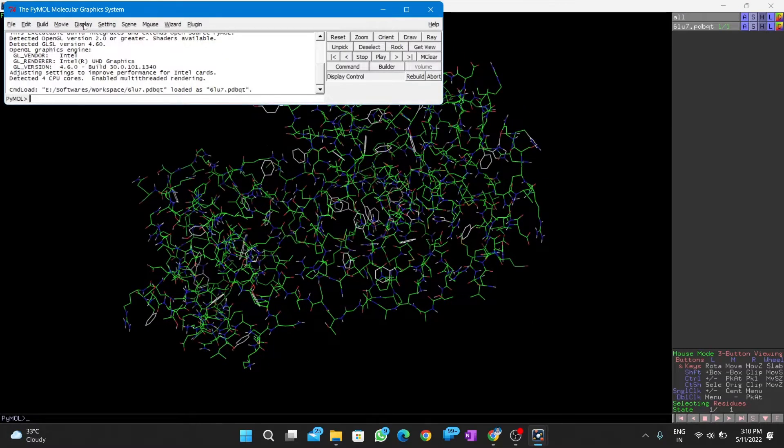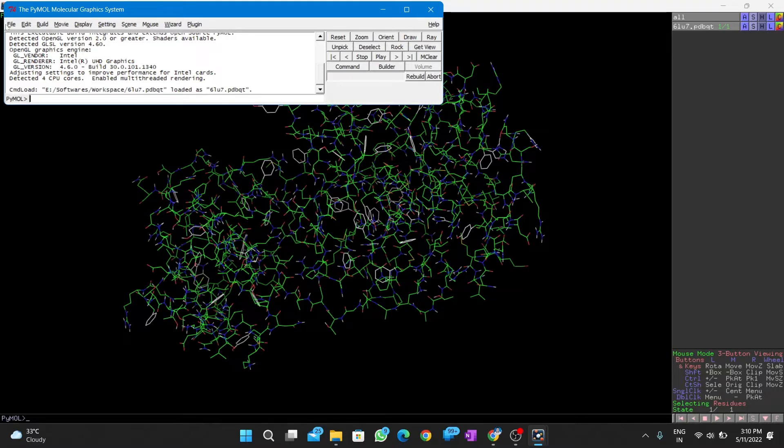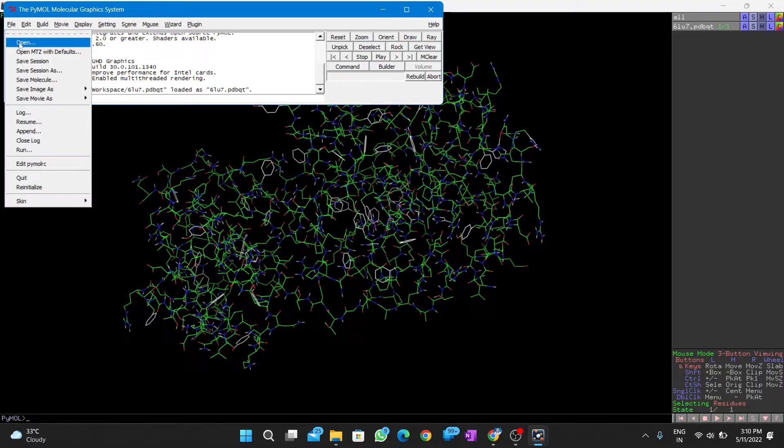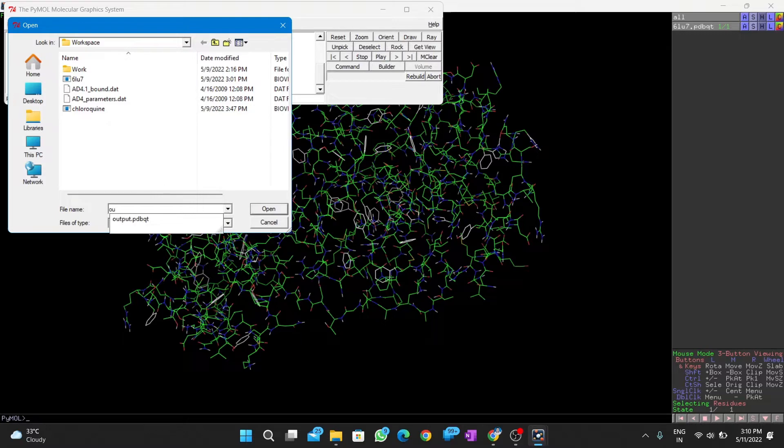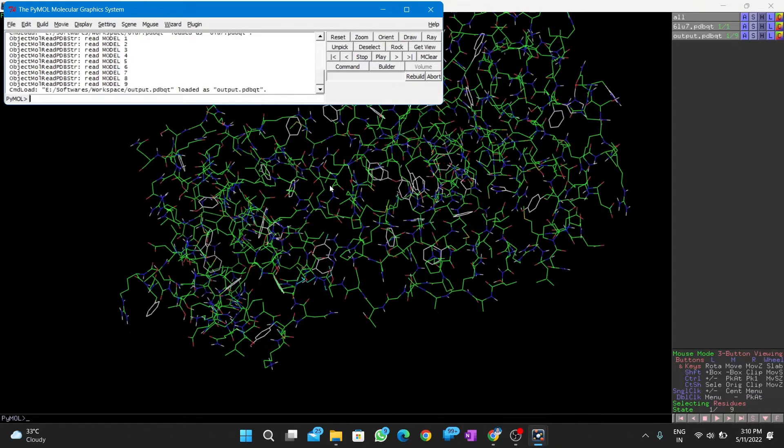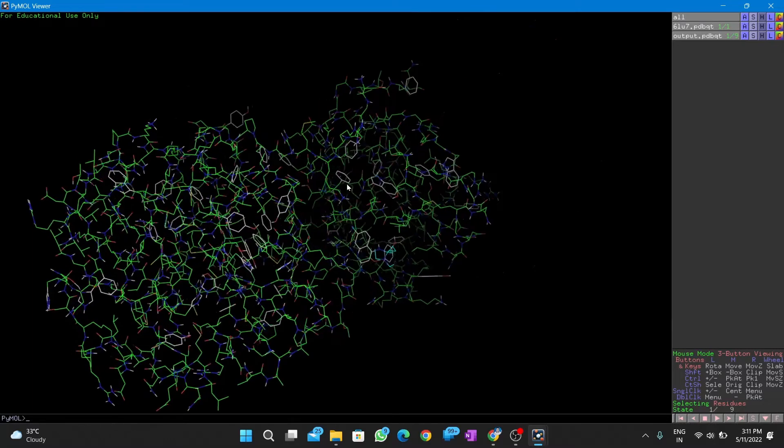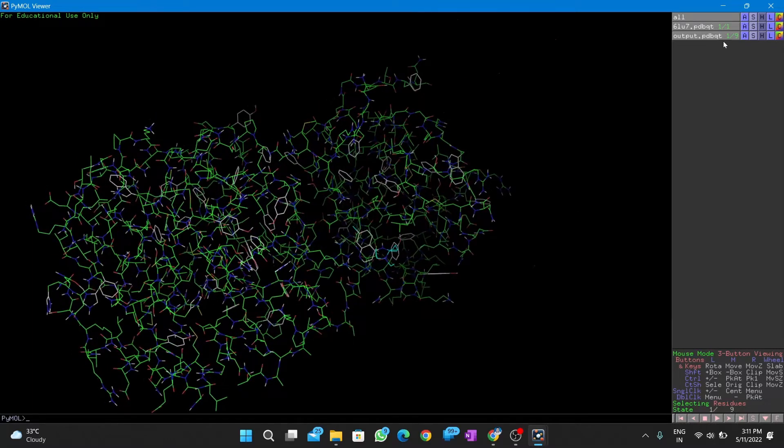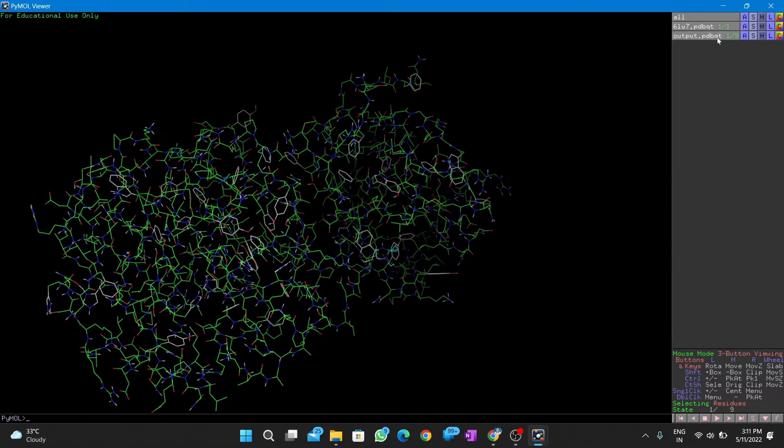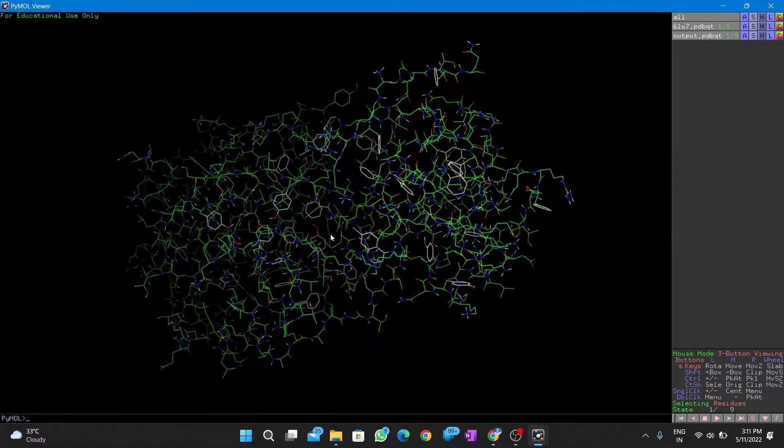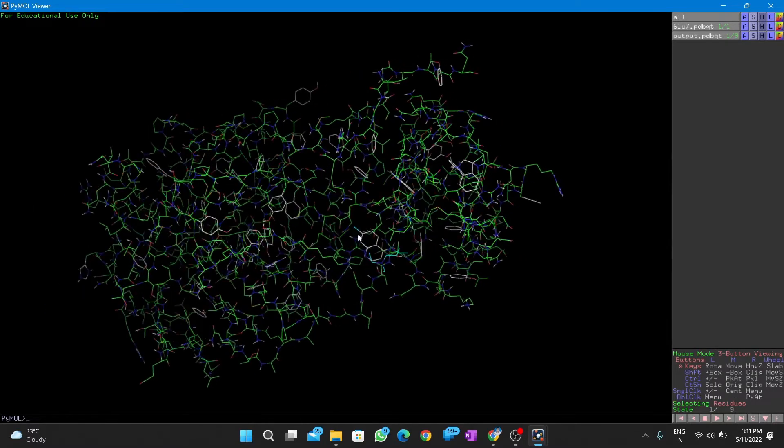Next, we open our output file which is saved in PDBQT format. You can see our output or the docked conformation in the binding site of the receptor.